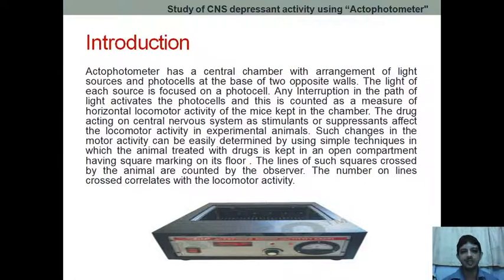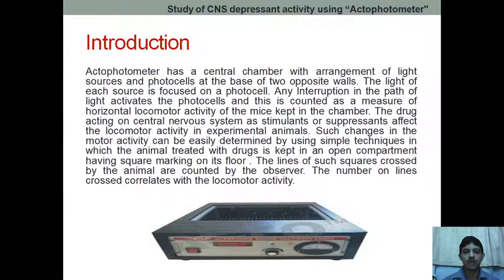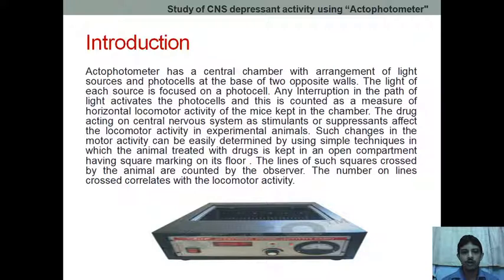This is the actophotometer through which we are evaluating CNS depressant activity. Next, we are going to see how we perform the practical using this instrument. I hope you have understood the principle involved in this particular experiment.